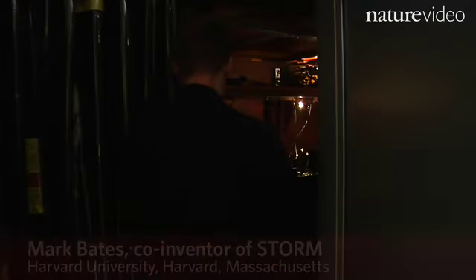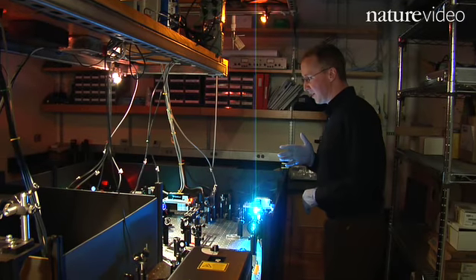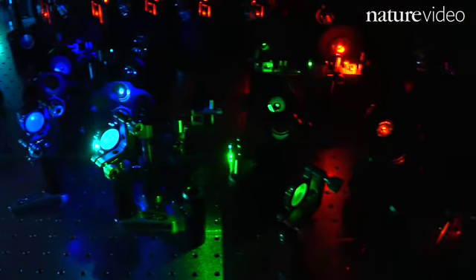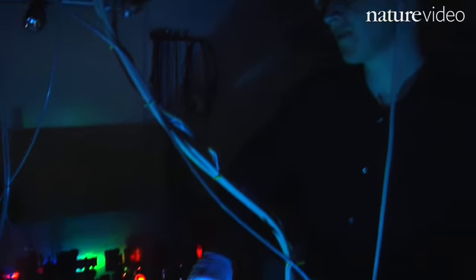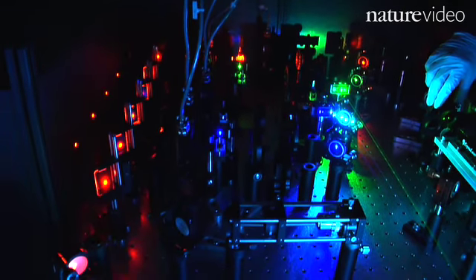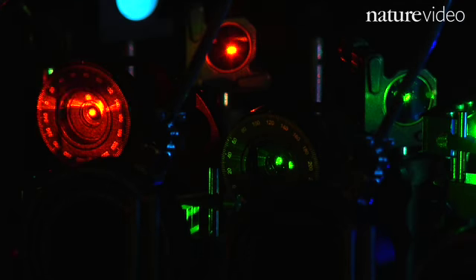So our microscope uses laser light for illumination, and we actually have several different colors from violet all the way to red for illuminating the sample. We have a fast shutter system that is able to switch the laser light on and off very quickly in order to activate and deactivate the switchable fluorophores.